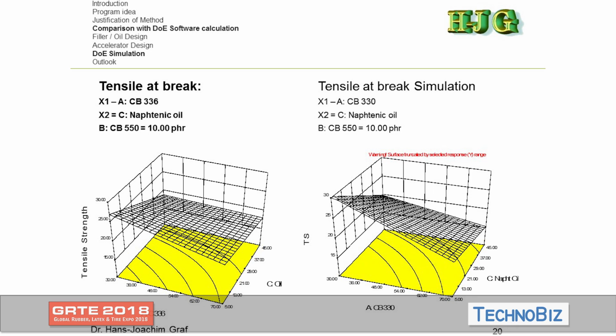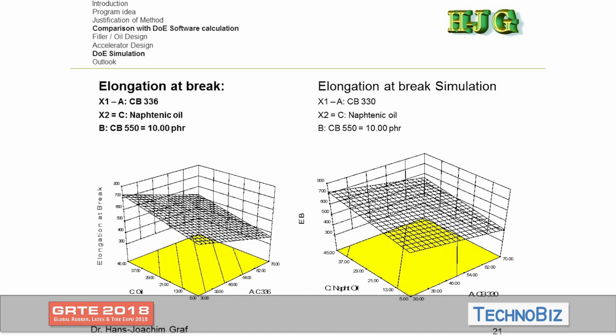So, and obviously they use also a different machine. I think that the standard Malaysian historically used the tangential mixer, and the Mahidol University, they have an intermeshing, so you have a different molecular weight as an outcome, actually. So you understand also in detail the onset, specifically when you see here elongation at break.